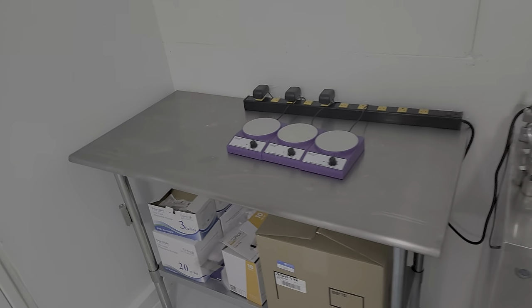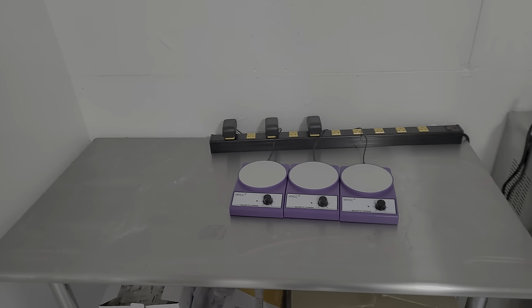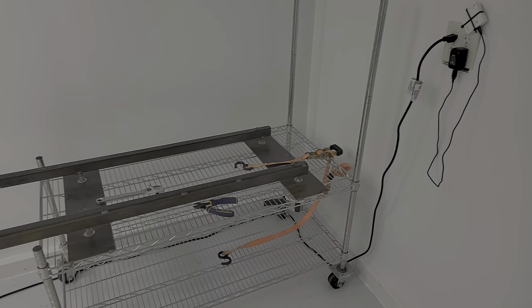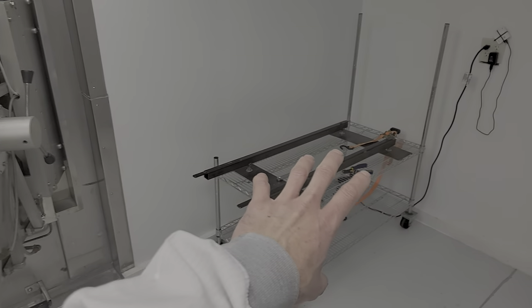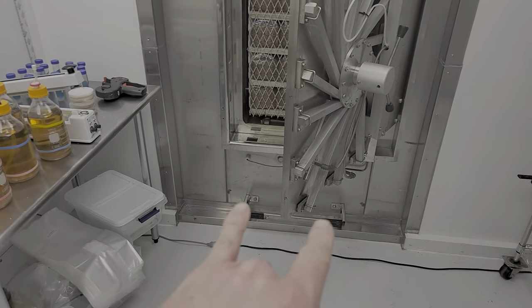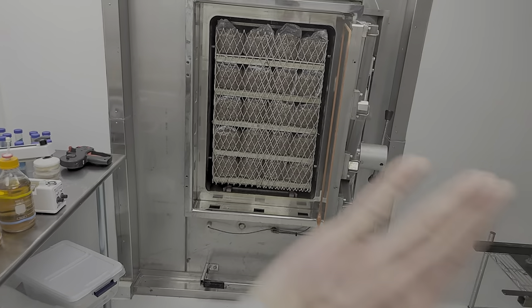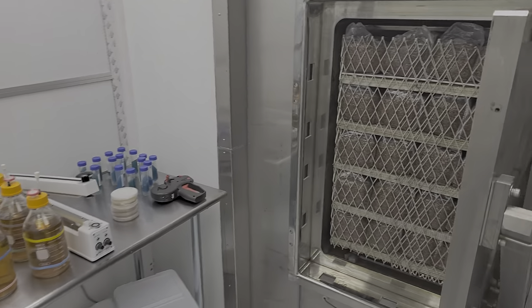Over here is my LC (liquid culture) station. I'm getting ready to do some LC mixing — I have it on a timer so it goes off every other day for about 20 minutes. The cart is still a work in progress; I'm still using a temporary strap setup to secure it to the autoclave and connect the top cart to the bottom cart, but it will eventually get proper latches. It docks up to the autoclave on those rails so it just comes out, and I can close the autoclave door and run another load if needed.